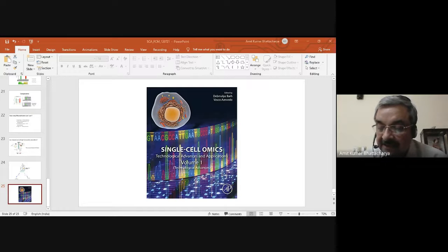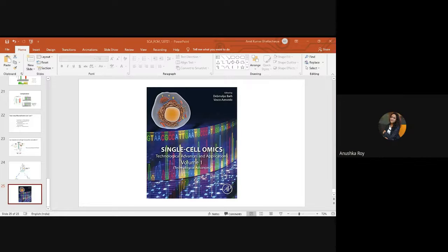At each point, if it finds that profile, it subtracts that light from that point. That's another approach. Yes, sir, got it.